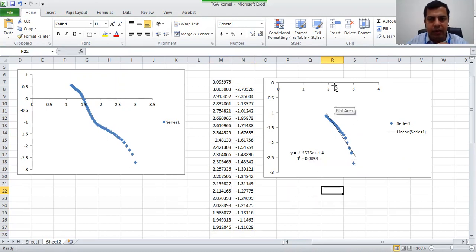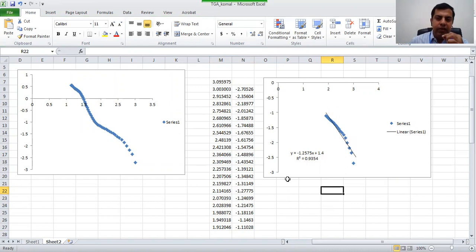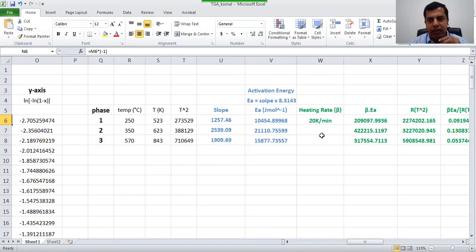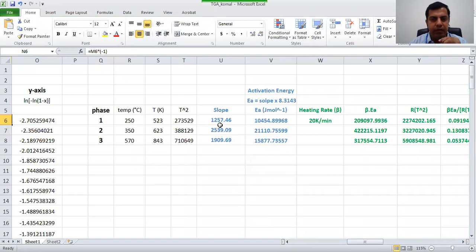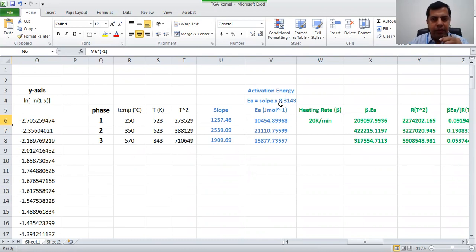Remember, we plotted the x-axis by multiplying by 1000 (i.e., in kilo units). So to get the value without the kilo prefix you have to multiply by 1000. The slope is 1.2575, so multiplied by 1000 it becomes 1257.5. This is important for the activation energy calculation. Similarly you can do this for phase two and three by selecting the relevant data, and when you multiply by R = 8.314 J/(mol·K), that gives you the activation energy in joules per mole. You can divide by 1000 to convert to kilojoules.